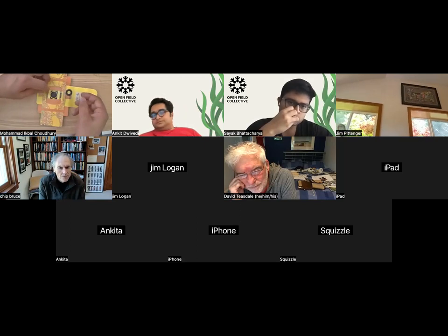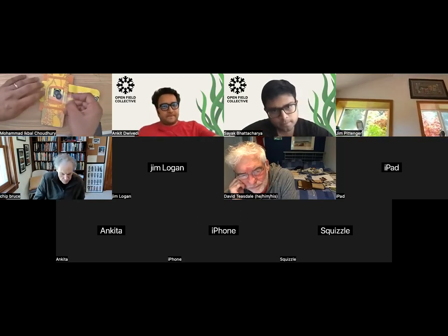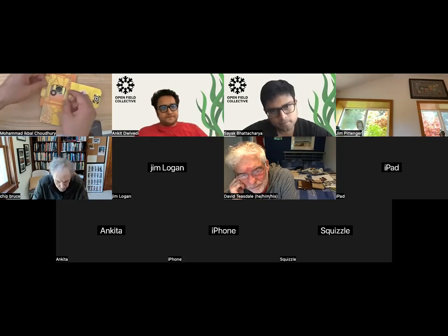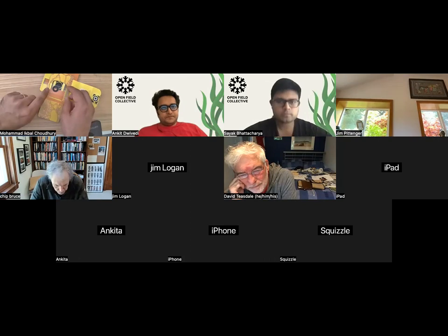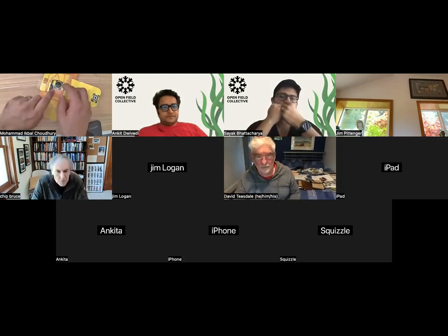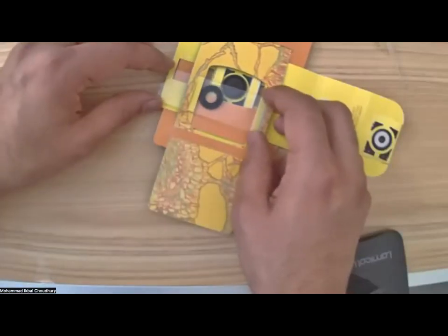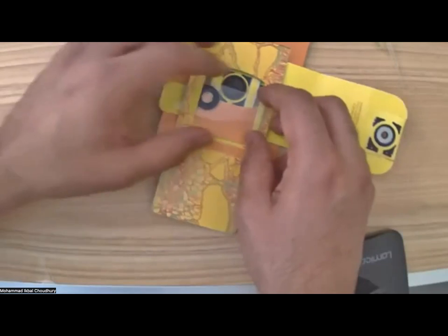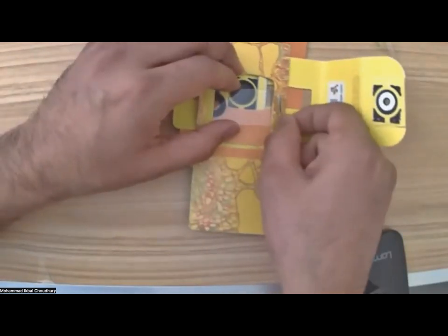What I do is I take this flap up and insert the slide by holding this piece of paper here like this. Now the slide has gone into one of the edges here, and you won't be able to push the slide with the sample in all the way, because the sample also has a bit of thickness, right? You don't need to. You just push it as long as you can place the other side of the slide through this flap here.